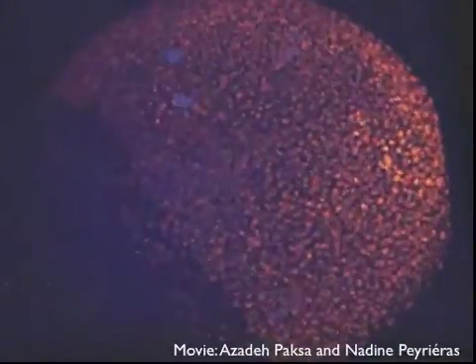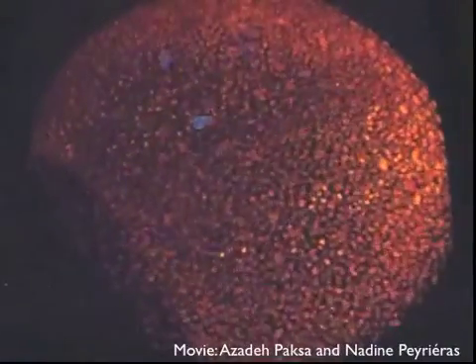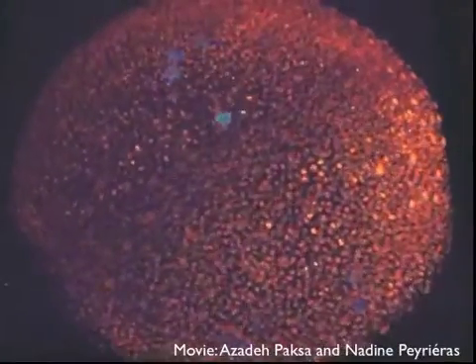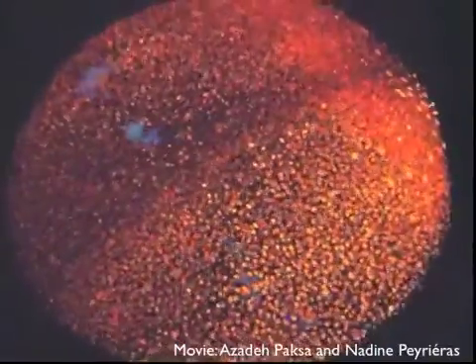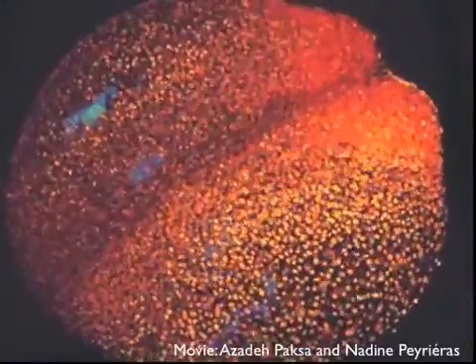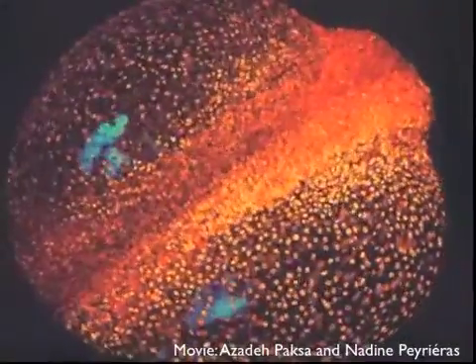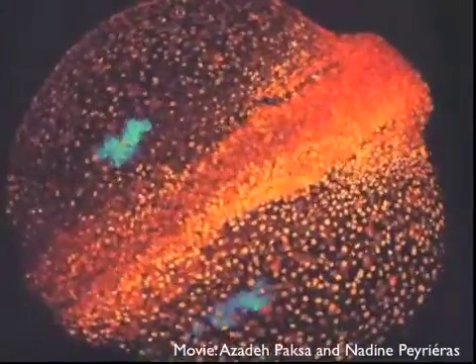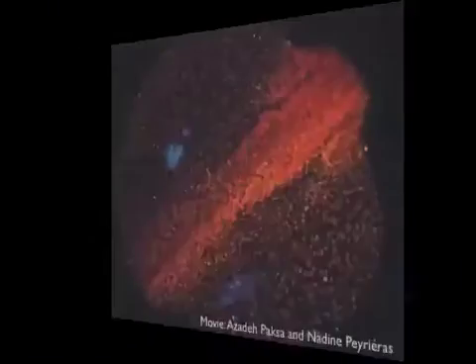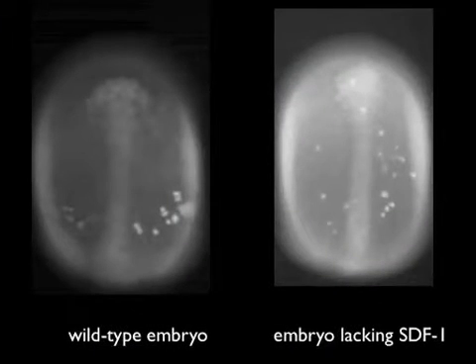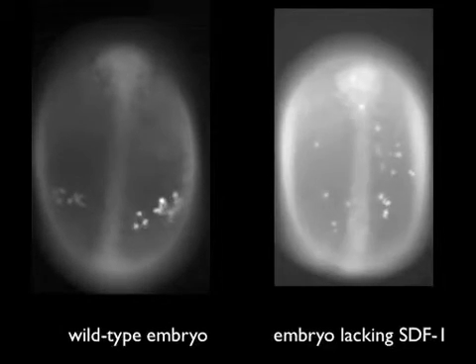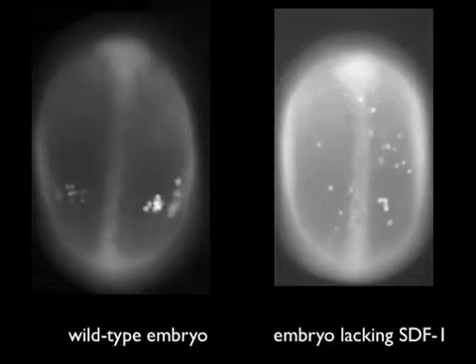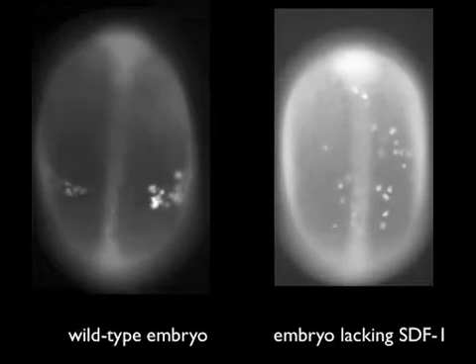The blue cells are germ cells migrating in a developing zebrafish embryo. There are two things to notice. One, the cells actively move relative to the surrounding tissue, marked in red. And two, the cells follow a certain route. The fact that cells follow a certain route means that they respond to directional cues in the environment, as seen in the embryo on the left, in which the germ cells cluster at a specific region.